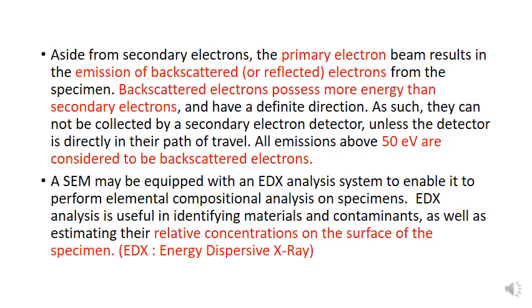And next, SEM may be equipped with EDX analysis, and I hope that you will get used to this kind of hyphenated method, like SEM combined with EDX analysis. SEM with an EDX analysis system is performed to investigate the elemental composition of your sample, your specimen. EDX is a tool or analysis instrument that can be used to detect or identify the composition of the materials in your sample. So what is EDX? EDX is energy dispersive X-ray.